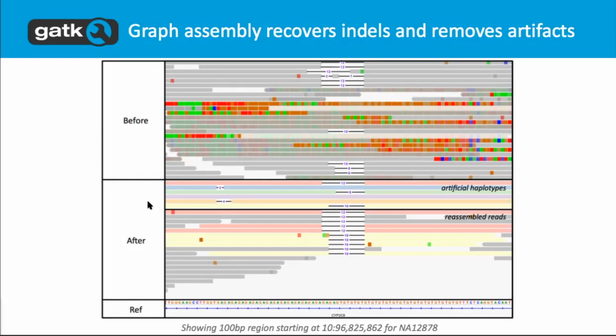Yeah. And for example, in the gnomAD viewer, when you're looking at variant calls that are made in gnomAD, you have the option to see the output BAM file from the original data.